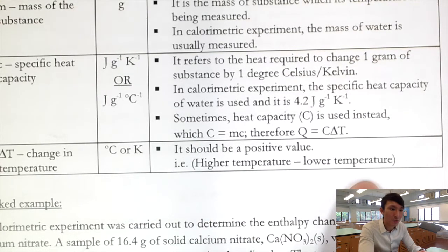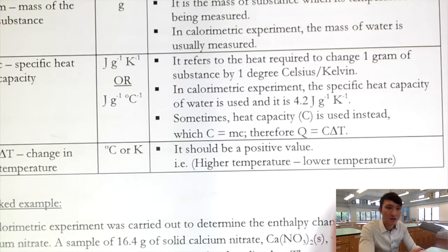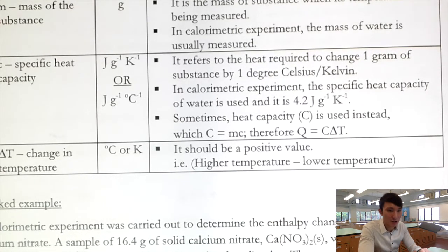And of course, knowing the final temperature, you should be able to tell whether the reaction is exothermic or endothermic. Then later on, you can rectify your answers. After all, positive and negative is not concerning the magnitude. It's concerning whether it is endothermic or exothermic. Okay? So just to make sure you get a positive value.